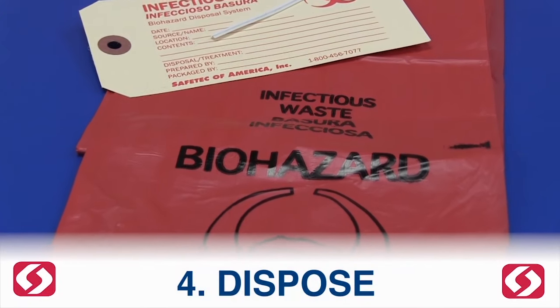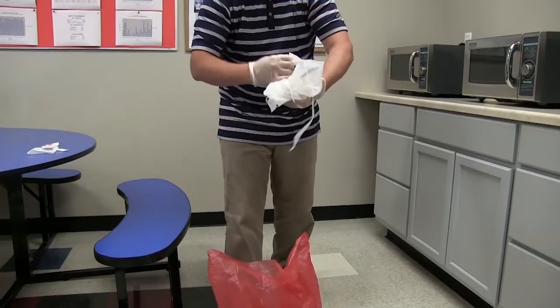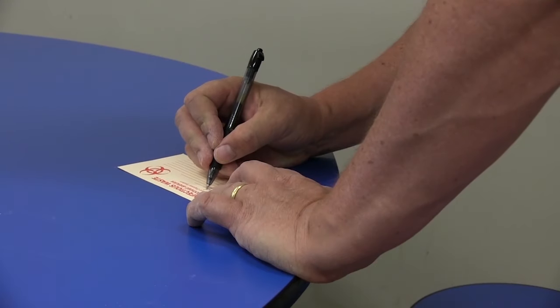Dispose. Discard the germicidal wipe, gloves, and safety shield and apron into a red biohazard bag, and dispose of the bag as required by your local, state, and federal regulations.